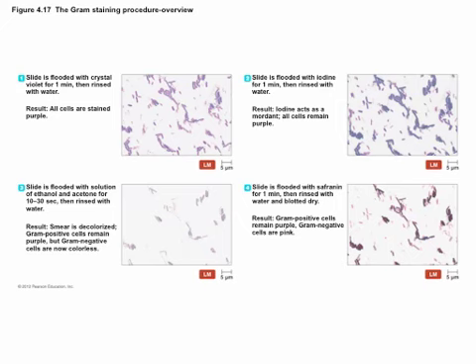Then you hit it with safranin. Who can tell me what safranin does? Counterstain, what does that mean? Say it louder. You don't know? What's it going to stain? So, does it only stain gram-negative cells? It stains membranes. It's a normal, basic dye. Okay? And it's going to stain membranes. So it's going to stain this membrane pink. It's also going to stain this membrane pink.